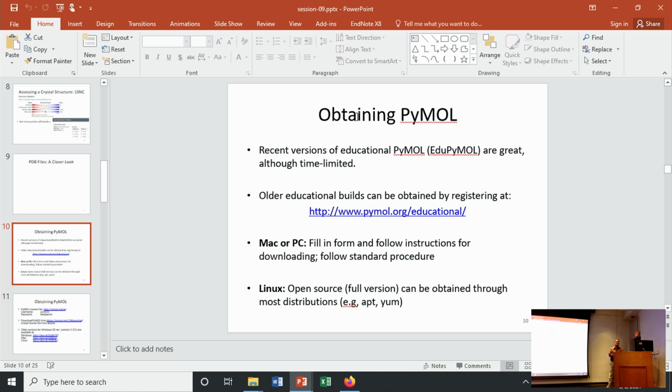On the other hand, I view it like PyMOL is $600 for an entire lab for 3 years. So everybody in my lab can have a licensed copy of PyMOL. And if my lab somehow grows to 15 people, that's still allowed. I don't ever see it growing that big. But for me, that's not a huge expense.